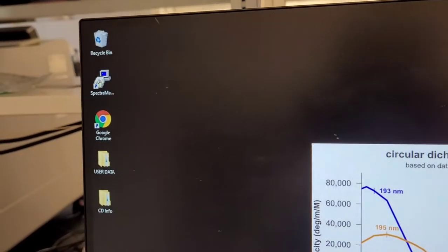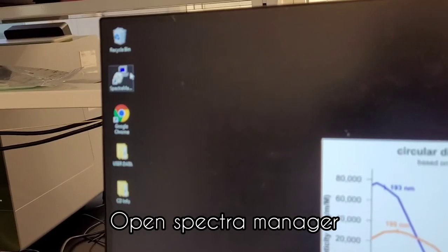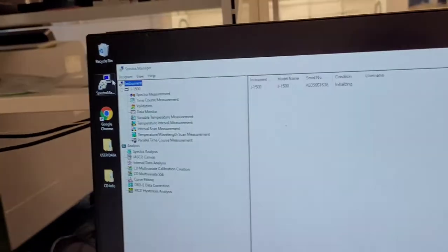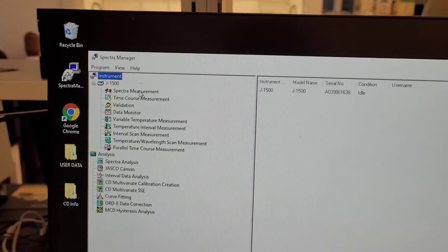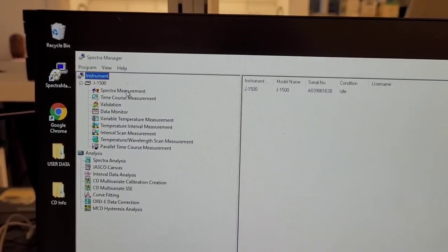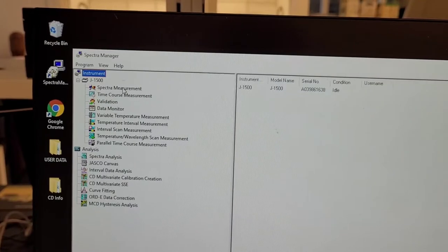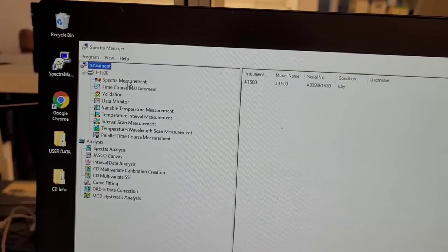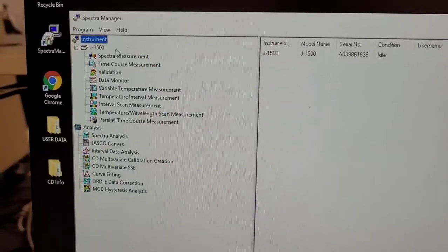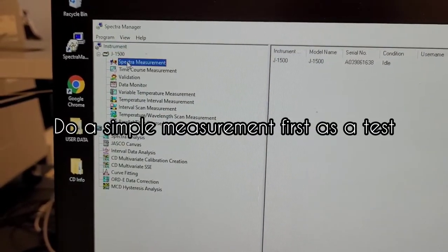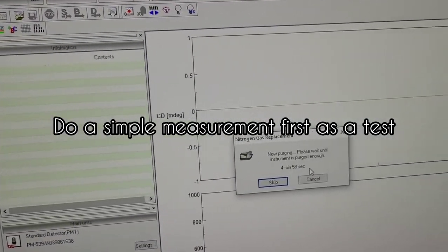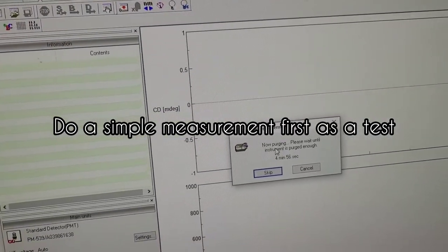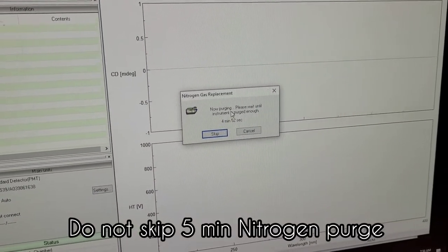Then open the spectra manager. Before we actually do a thermal denaturation, just do a simple measurement to make sure that you are getting signal and everything's okay. For that, I already have a video and you go to spectra measurement and wait five minutes until the whole instrument is purged with nitrogen.